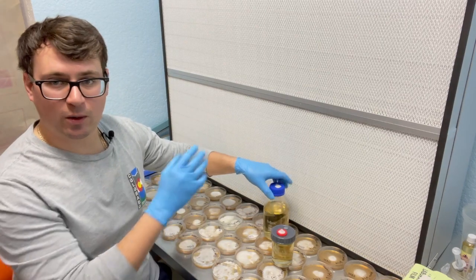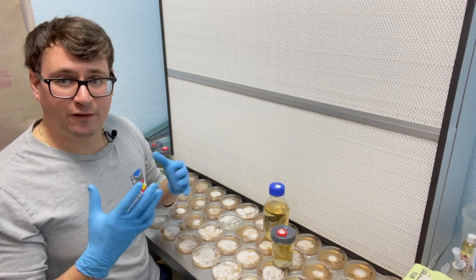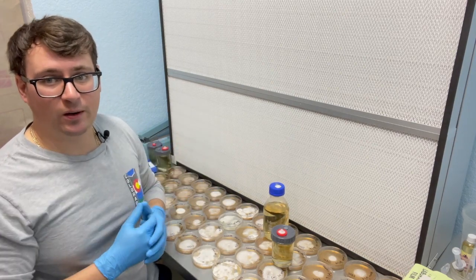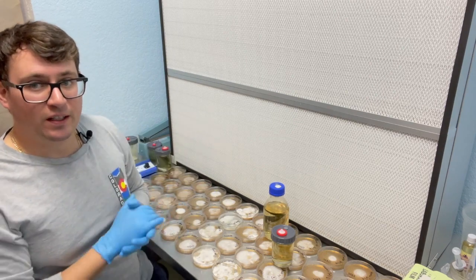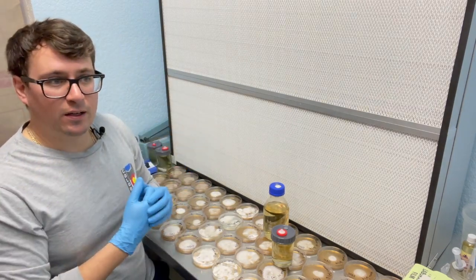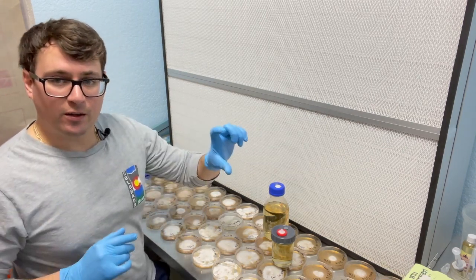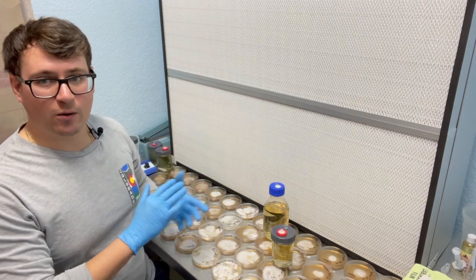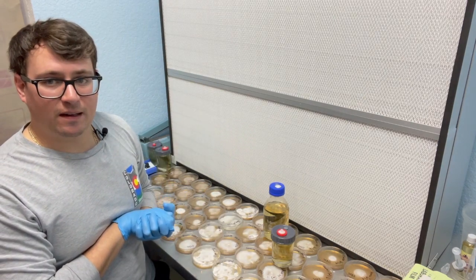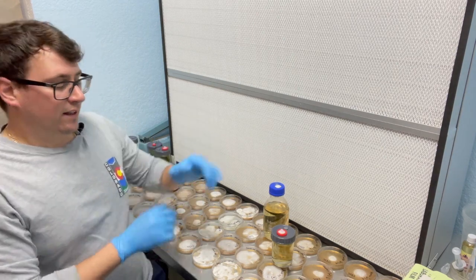Check out our video on utilizing liquid cultures and the media extraction bottle for how we prepare our liquid cultures. It's just a sugar water solution — there are tons of different recipes. We like to use Bjorn's filtered honey, a local honey from Boulder, Colorado, and it's been working phenomenally. We also use corn syrup and different types of liquid powder broth. Just make sure it's about a 4% sugar solution and you should be fine.